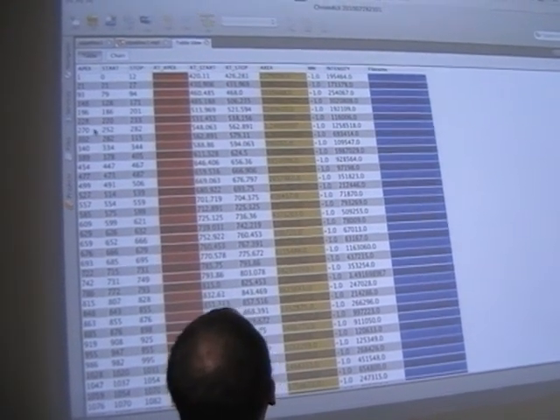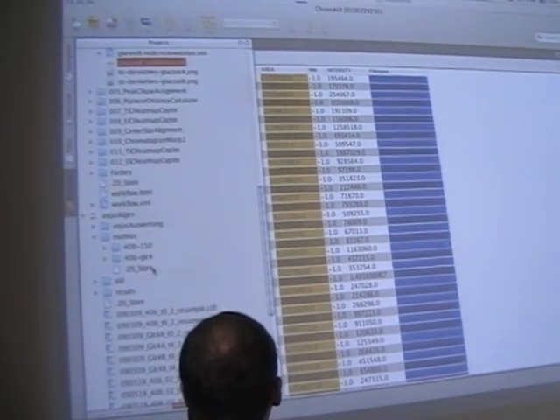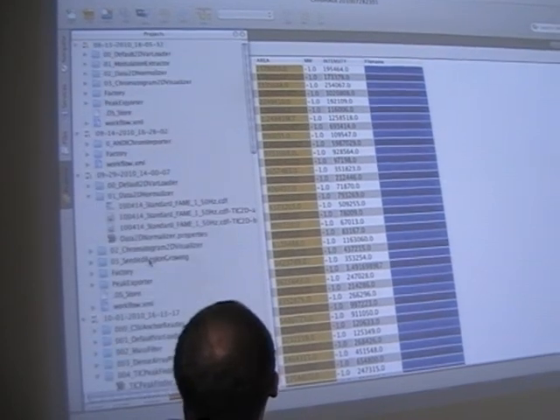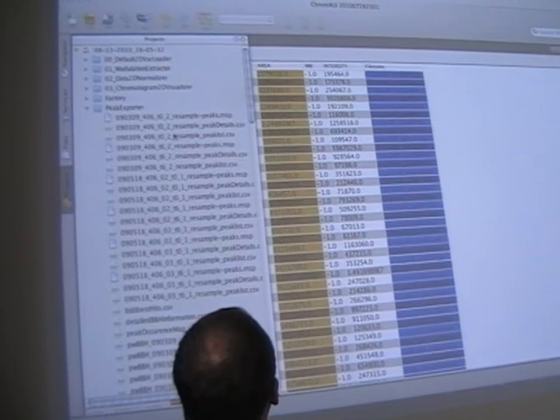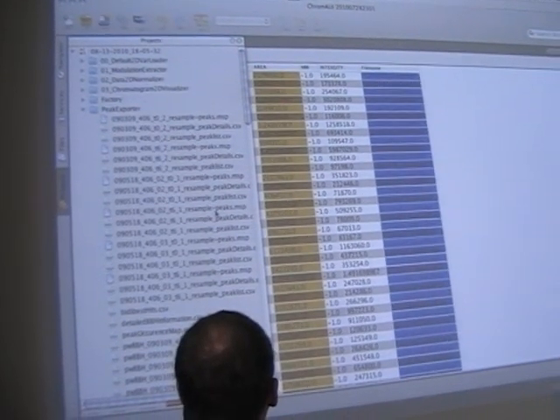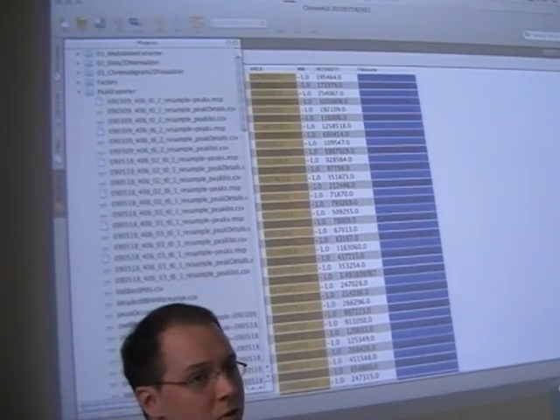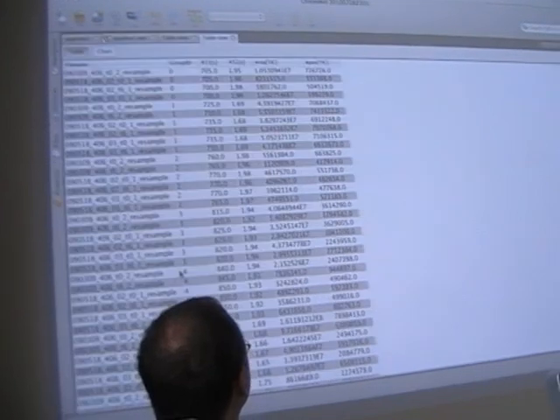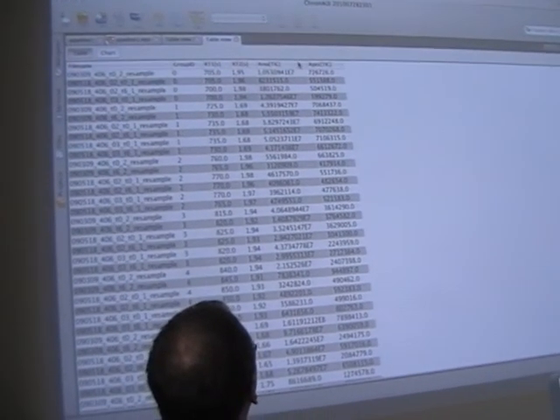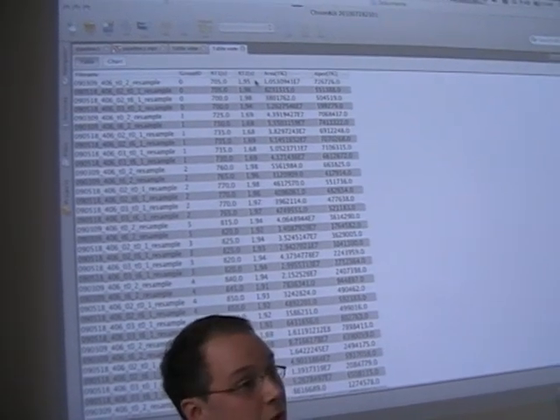I think we also have a data set for the 2D peaks. I have to find out where I put it. I think down here. Was it the peak occurrence map? It was, I think so. Yeah, correct. Okay, so here we have a result data set for the 2D chromatography.